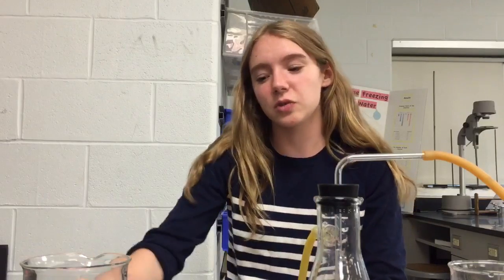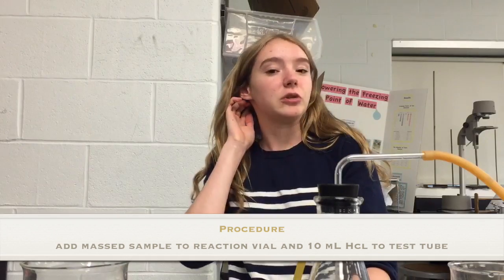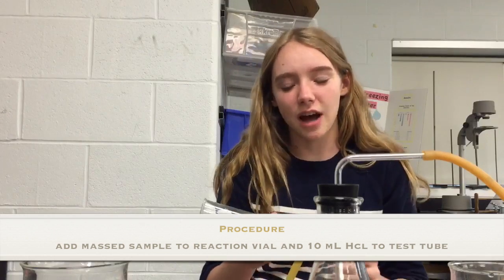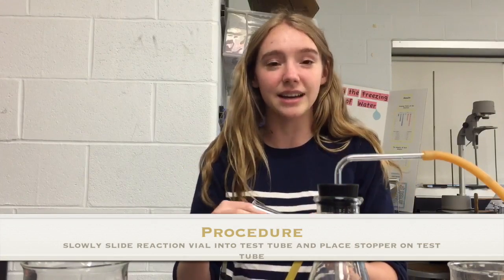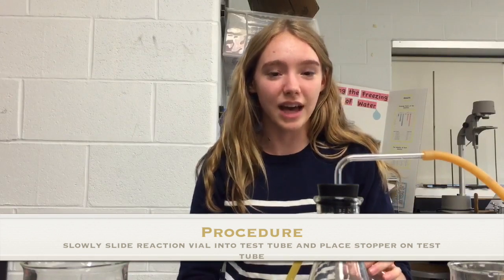The first part of this lab is a test trial based off your calculations with either pure aluminum or pure zinc. Weigh out the pure metal and place it in a small reaction vial. Then measure out about 10 milliliters of 6 molar hydrochloric acid and pour it into the large test tube. Taking your small reaction vial, slowly and carefully slide it in so as not to start the reaction — don't let any of the liquid into the reaction vial yet.